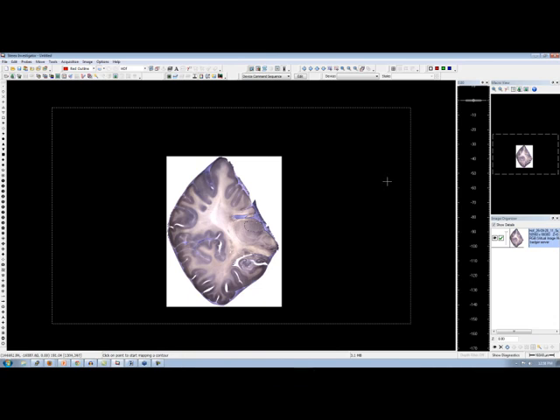Well, I mean, this is phenomenal. Jeff, this was basically as if you opened this file directly from your local hard drive, except as you mentioned, this is a really, really large file. So with Biolucida Cloud integration, I can imagine a situation where one user captures this image, uploads it to Biolucida, and then I can just sit in front of Stereo Investigator and open it as if it were a local file. Exactly. We're really trying to get the integration with NLSI to be as seamless as possible.